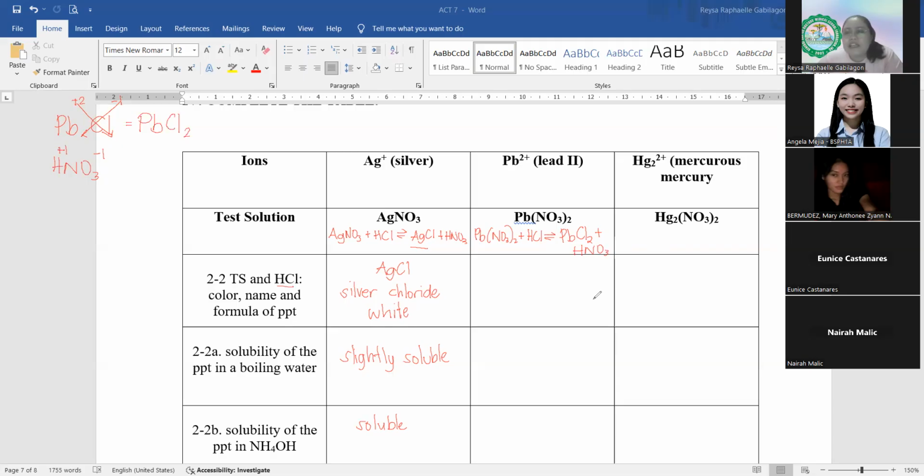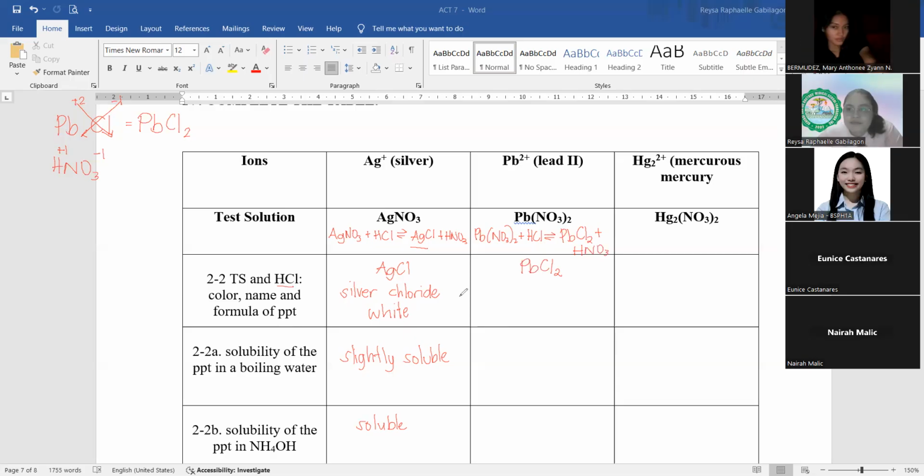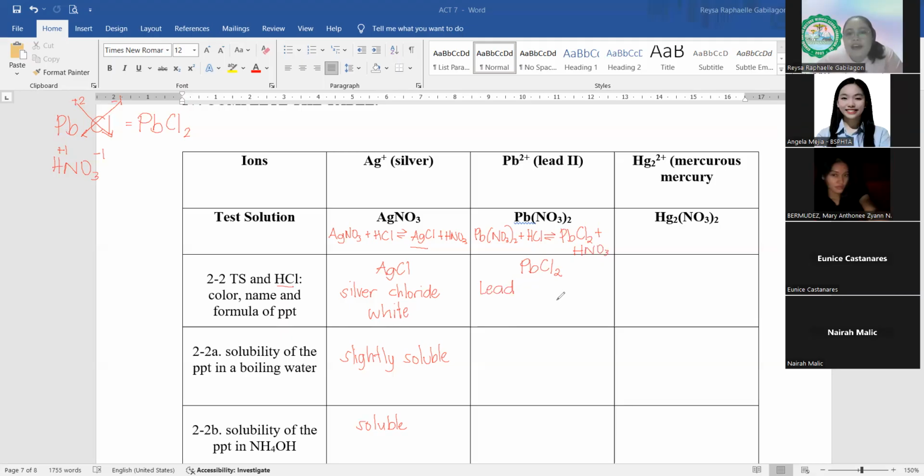So, definitely they are not precipitate. So, yung kasama talaga nila yung precipitate class. And this is the PbCl2. How do you read that PbCl2? Yung pangalan yan? Yes, Aya? Lead(II) chloride po. Okay, lead. And then remember, dalawa yung pwedeng charge ni lead. So, lagyan mo talaga siya ng open and close parenthesis. So, this is lead chloride.